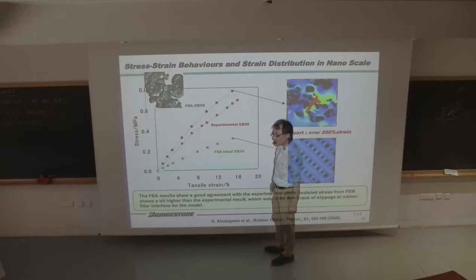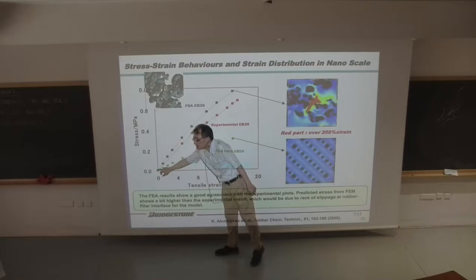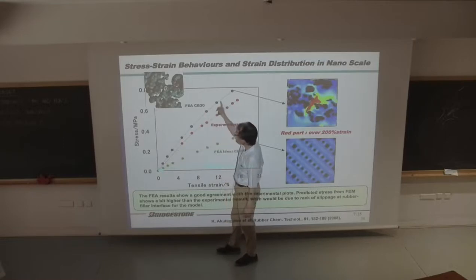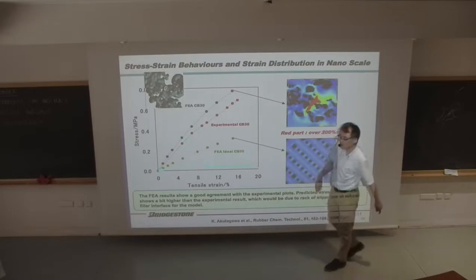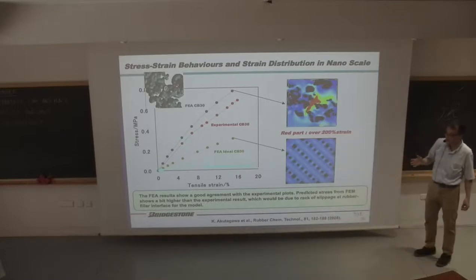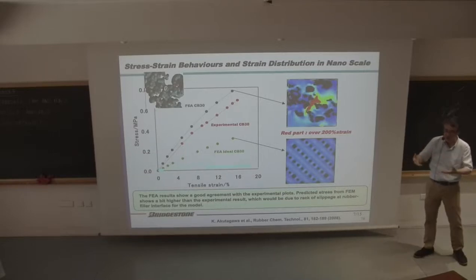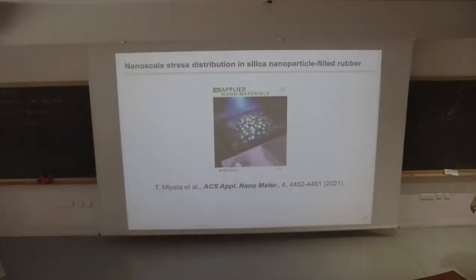But the biggest reason, I think, at the time was that we know the 3D structure at the quiescent state, but we don't know the structure experimentally when we stretch. Up to those points, there are only computer-generated images and calculations. So we need to make sure how the sample structure changes, and that it corresponds to the computer-simulated structure. That's the motivation. Okay.